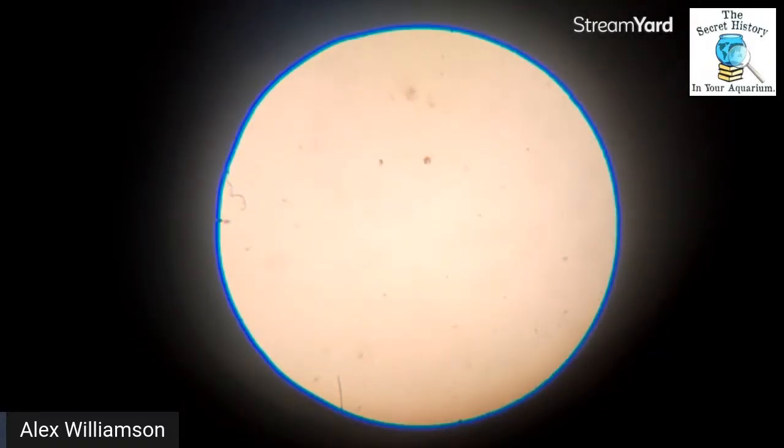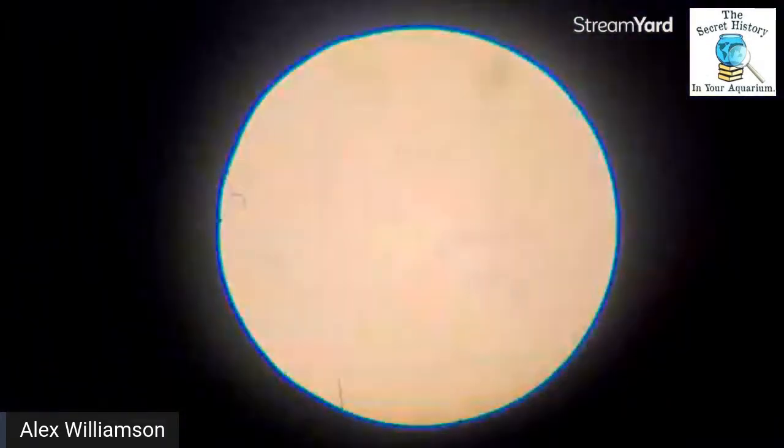Water that looks completely clear to the human eye, and it is full of things swimming around. And this is at 10 times magnification. Look at all those things swimming around. In fact, I'm tempted to feed that to my babies, to my baby fish. I wish I just knew that it wasn't, you know, laced with some sort of terrible worm or nematode. But I guess we can take a look and I could culture it.